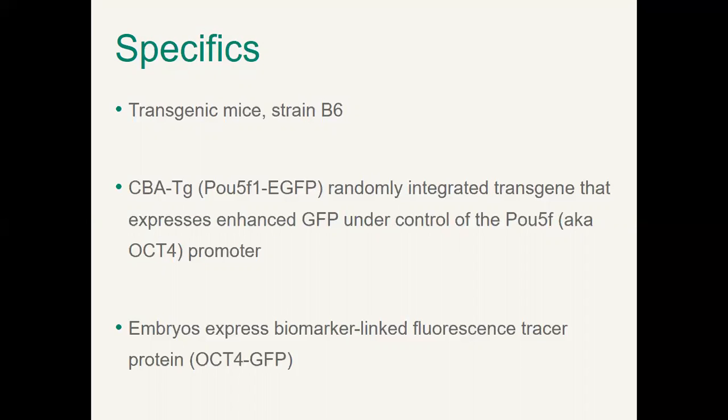By detecting the green fluorescent protein, which shows green light, we can see the OCT4 expression.